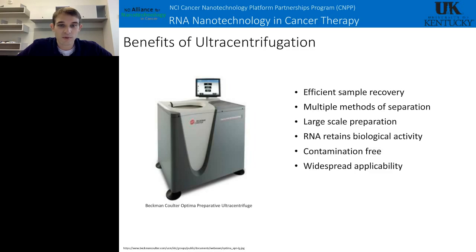We can do large-scale preparation. The method I outlined in this webinar uses 5 milliliter tubes, but this is a very scalable method. You can definitely scale it up to larger tubes. It's contamination-free as long as you work to prevent any degradation of your RNA. Then it's relatively easy to keep contamination-free, and your RNA will also retain its biological activity, because most of this is carried out in different salt solutions, and RNA is very stable in most salts.